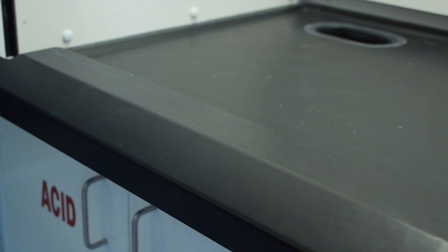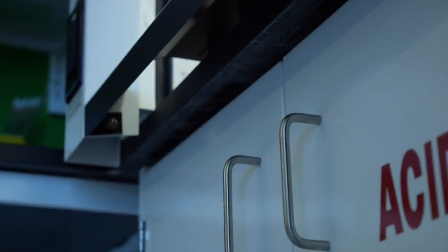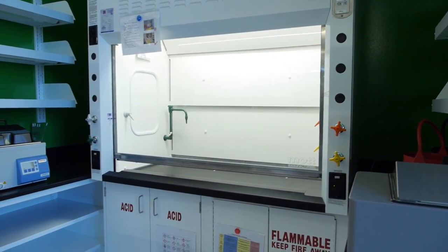Airfoil. Make sure that there are no obstructions blocking the airfoil or sill. This is a deflector located at the front of the fume hood that's shaped to promote uniform airflow into the fume hood, preventing the creation of turbulent eddies that can carry vapors out of the hood.